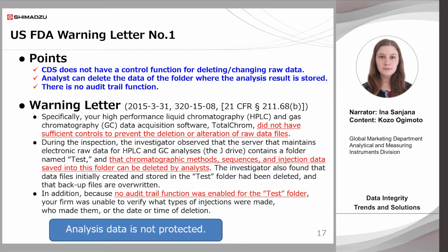The letter firstly points out that the deletion or modification of data cannot be controlled in the LC or GC systems. This is true for systems where the analysis data is stored directly in a Windows folder. In other words, the analysis data is not protected. The letter points out that analysts can delete data in the folder where the analysis results are stored. It also points out that there is no audit trail function. We can see that if there are no data protection or audit trail functions in the equipment, this may be pointed out in a warning letter, so we should use equipment which includes these functions.